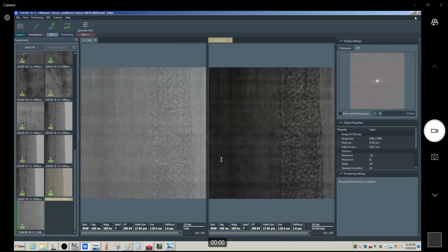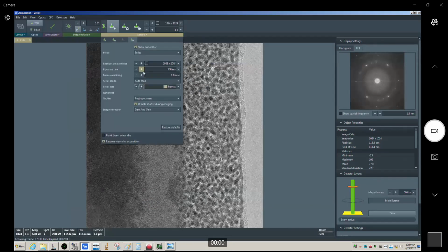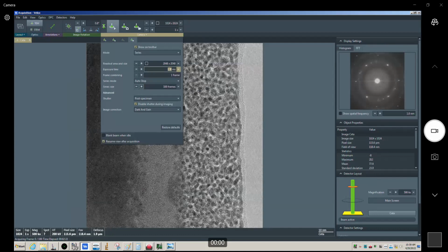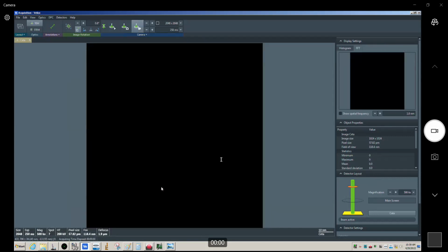The way to get around that, of course, if we wanted to try this, would be to bump this number up. We could bump up the exposure time per frame. If we went to 200 milliseconds, the other thing you could do too is reduce the binning down to something lower. Let's put this at, say, 1/4 of a second, and we'll do 40 frames. We'll see if that helps us a little bit more.